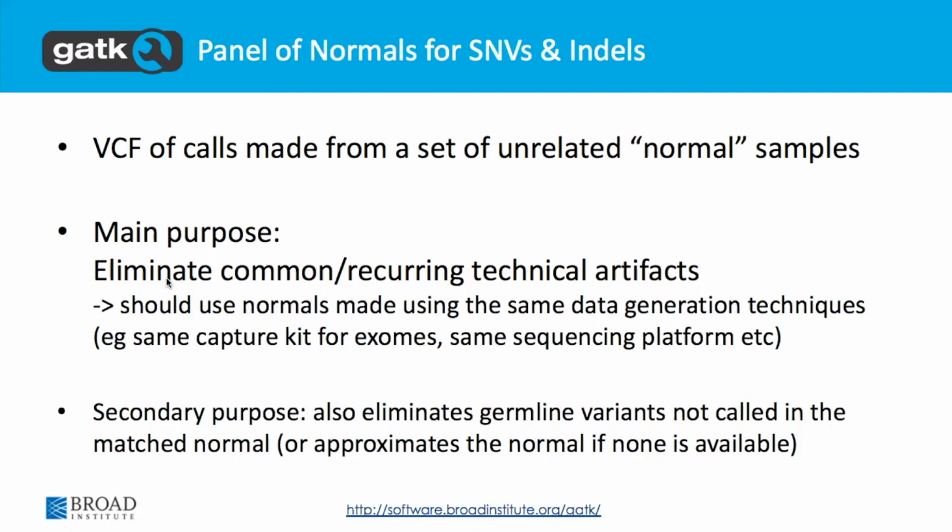In some cases, we have recommended trying the somatic caller for non-somatic calling, on organisms where you're doing a pooled experiment. Sometimes we have had questions like that from people sequencing insects, where they're crushing together a whole bunch of different individuals and calling variants on the population instead of just an individual. There you have a sort of pooled ploidy effect. In principle, the somatic calling should work on that. I believe people are using it in that way.